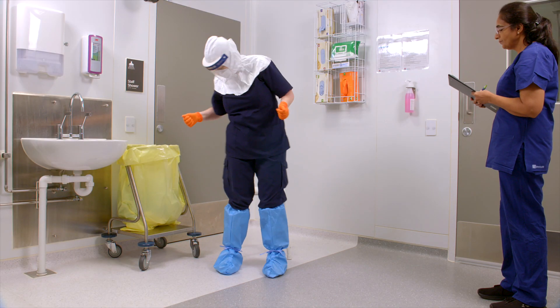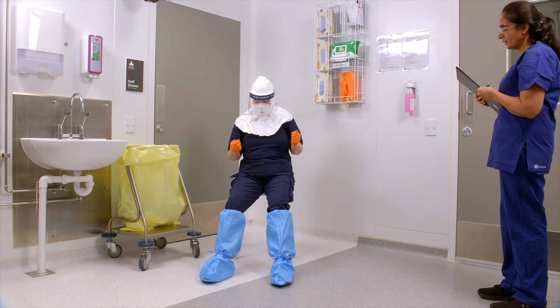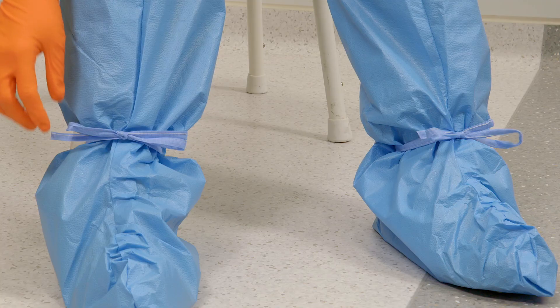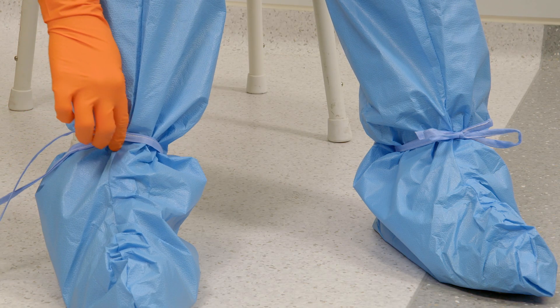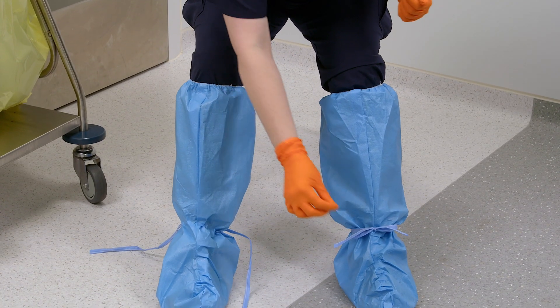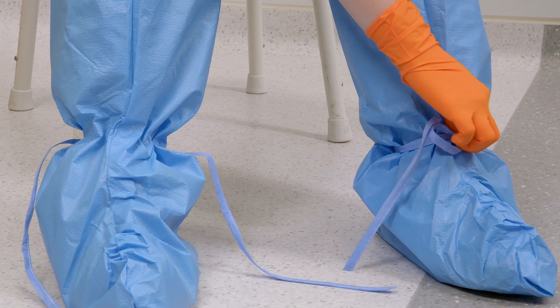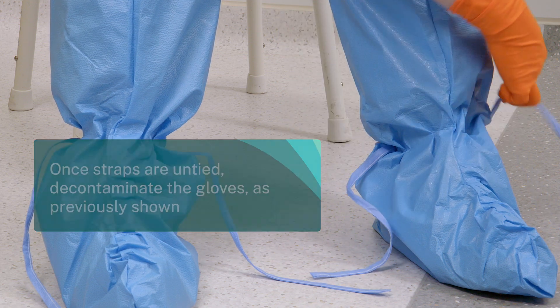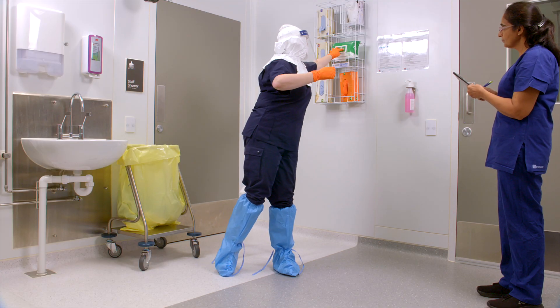Sit on a clean or covered stool or chair to begin removal of the booties. Carefully loosen the straps. Ensure the forearms do not touch the outside of the booty as this poses a self-contamination risk. Decontaminate the gloves with wipes.